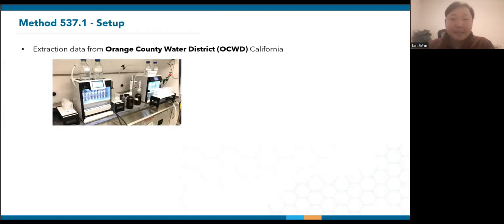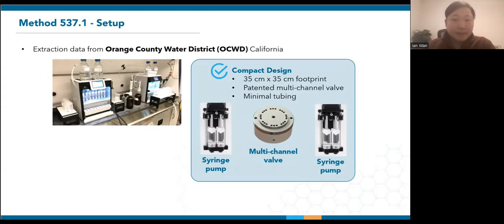The SPE03 on its own is only 35 cm by 35 cm. So how do we automate eight samples in such a small footprint? Unlike conventional design that involves multiple valves and pumps per sample channel, the SPE03 achieves the loading of eight samples using just one multi-channel valve and two sets of syringe pumps. This drastically reduces the complexity and size of our systems while offering high extraction efficiency. This design also keeps the tubing minimal, making it unnecessary to prime the lines and easy to clean.